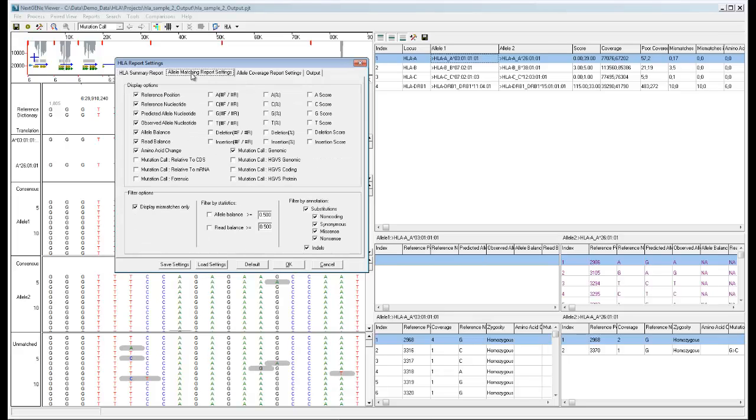On the allele matching report settings tab, you can again choose which columns should be included, and you can also select filter settings. You can also deselect display mismatches only to include every position for the alleles in the report instead of just the mismatch positions.